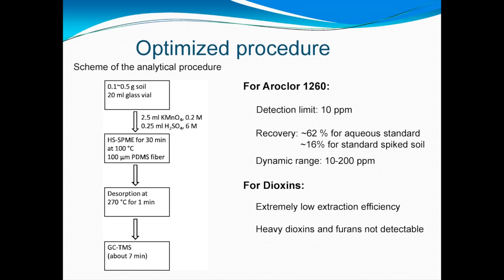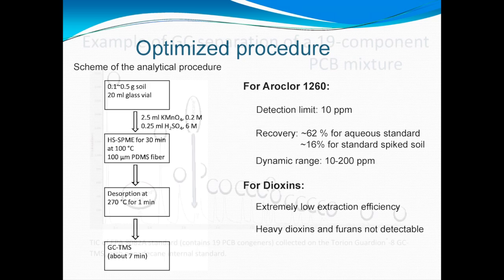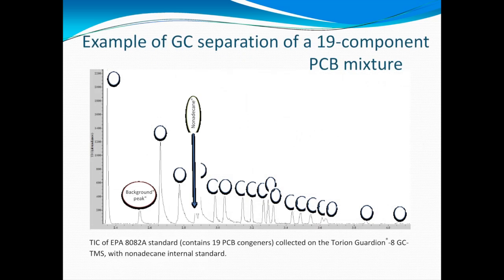For dioxins, we've tested this method, and even with some modifications to the procedure, it's much, much worse. Dioxins are much harder to get in the air above the soil, and so much harder to remove by these methods. Here's an example of what the data looks like.